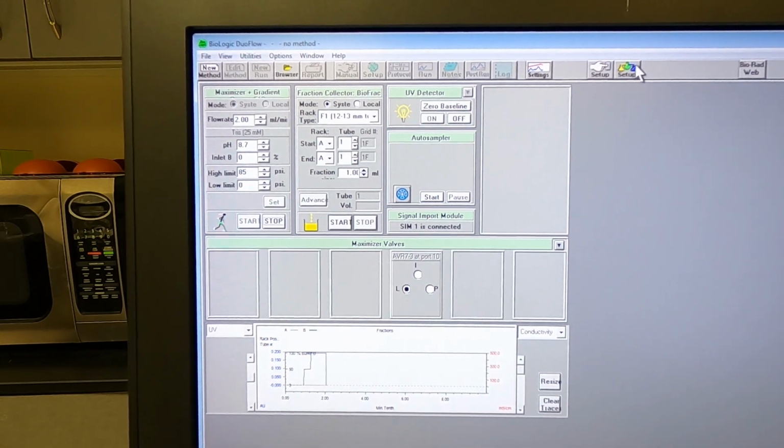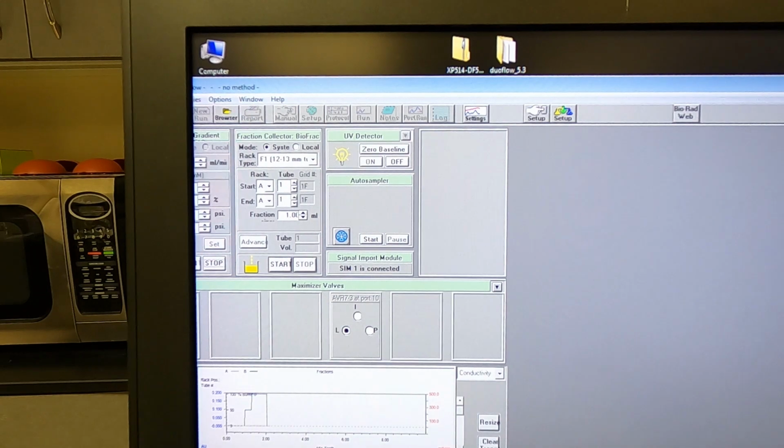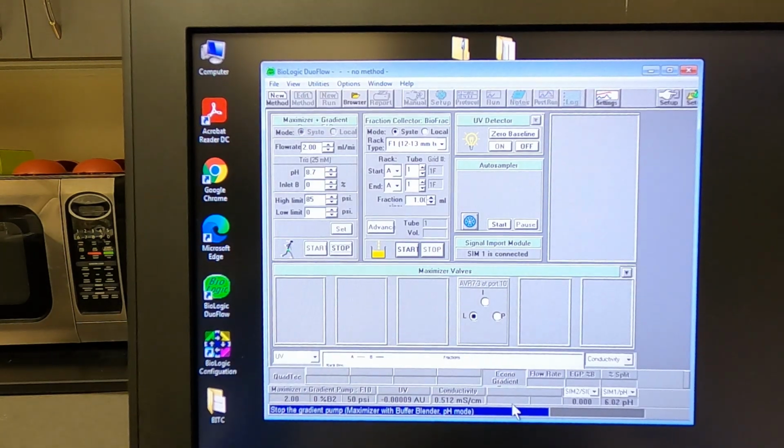And then one other thing I want to point out on the software is you can't see it here, but let me move the window a little bit. Okay, so at the bottom here, you're going to see live values. You're going to see what the determined value or the flow rate is. So here it's 2 milliliters per minute, and it matches what we have up here. Percent B2, right? 0%, which it's set at currently. It's also going to give you, and this is most important, a live pressure reading, right? So we have our pressure limit set here, but at any point in time you can look at the bottom and see what the current system pressure is.